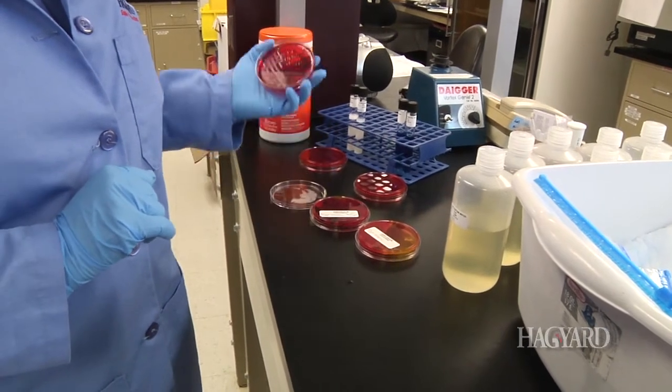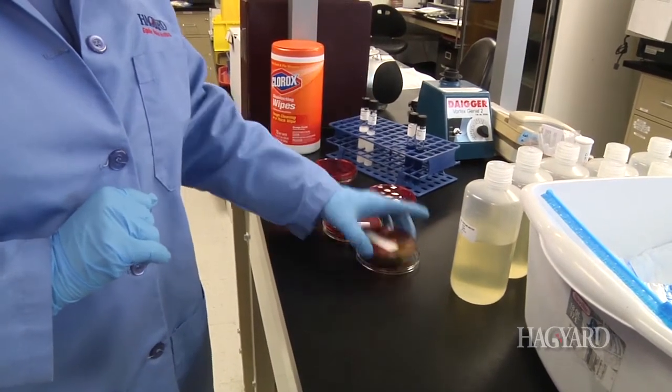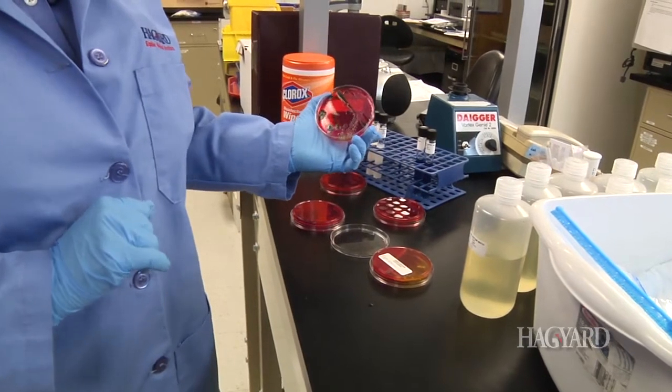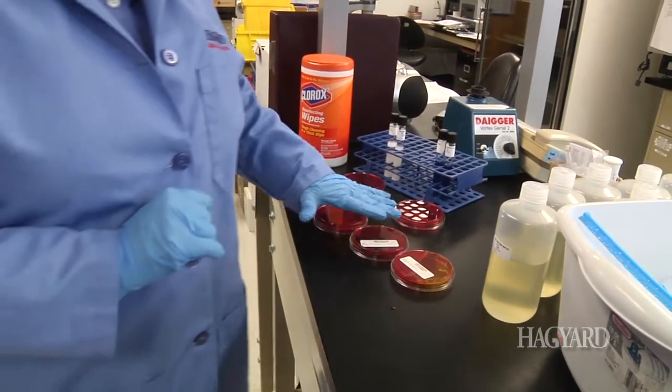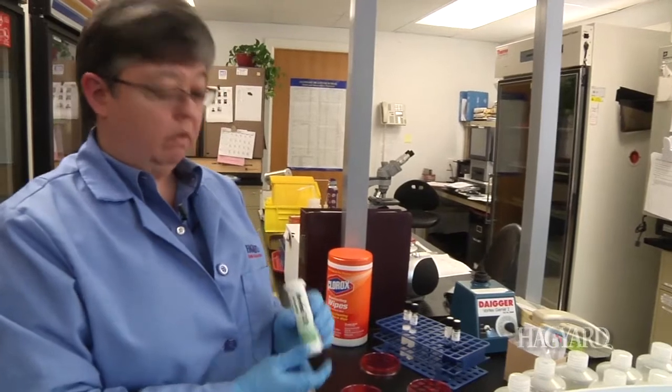On the plate, the salmonella will produce black or clear colonies, whereas other organisms can produce yellow, or some can produce black colonies that are similar to salmonella. And at this point, whenever we see suspicious colonies on the plates, we are going to perform our rapid diagnostic test, the Reveal from Neogen. If the Reveal is positive, we then will follow our protocol that has been established by our infectious disease officer and notify the infectious disease coordinator, who can take proper protocol to protect our patients, our employees, and our facility. We will then further confirm the ID with other identification methods and perform a sensitivity.